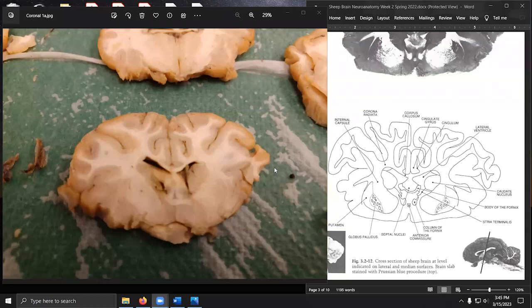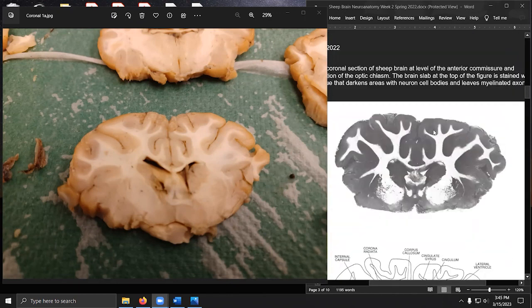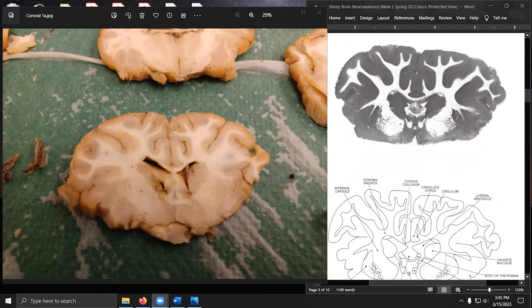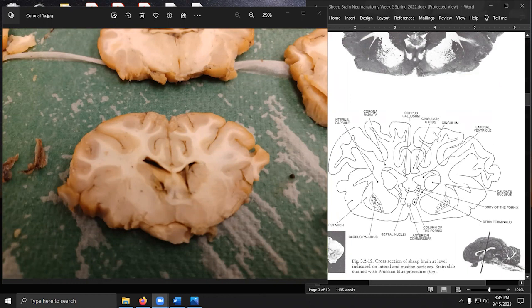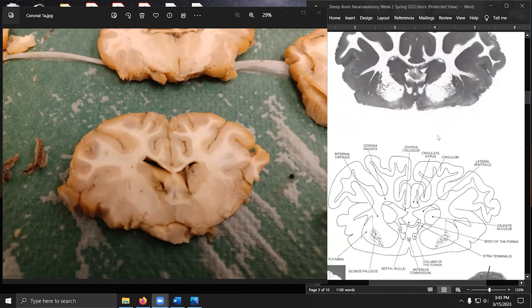I figured in lieu of trying to show these in video, it would probably be better to show these in static images and then do some illustrations via Zoom's annotations feature. So let's go ahead and do that now. First, we have our beginning coronal section on our week 2 packet. This is going through parts of the basal ganglia, in the basal forebrain area. We're going to try to identify some structures in the following images. In each of these cases, I have multiple images, so that if you were given a live specimen, you have some experience seeing the distinctions between different specimens. So let's give it a go.